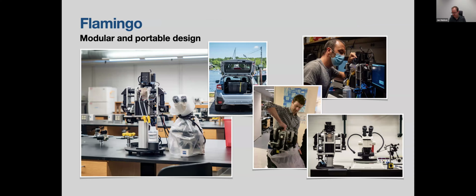And that's something we've done over the past few years, and we can show that this really works quite nicely. So we've taken this to courses like at the Marine Biology Lab in Woods Hole. We've had this set up there for several courses now over the past few years. We've taken this to UCSF, UCSD in California. The picture here on the top right is at Harvard. So we've actually shown that the system is portable and robust to be operational in remote places outside our lab.